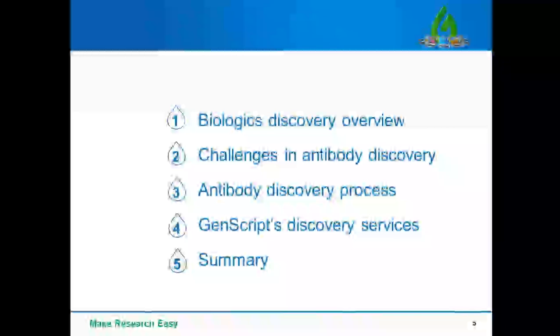Good morning, everyone. Thanks for coming. I would like to take this opportunity to introduce the general process of early antibody drug development and also share with you some of the tips and experiences in this industry. For the overview of my talk, I will first briefly introduce the challenges in the field and then talk about the standard discovery process with emphasis of antibody molecule engineering and its QC assays. In the end, I will briefly introduce the capability of our antibody engineering services and then take questions.